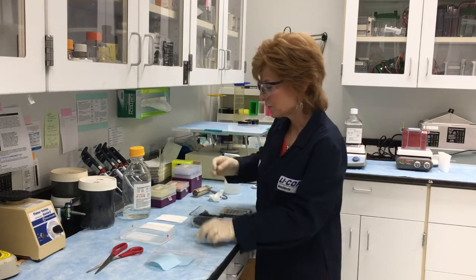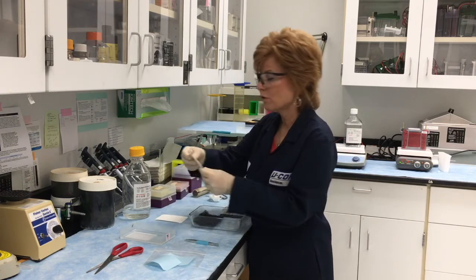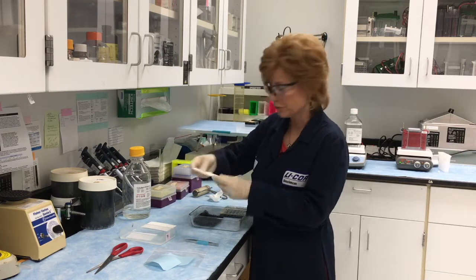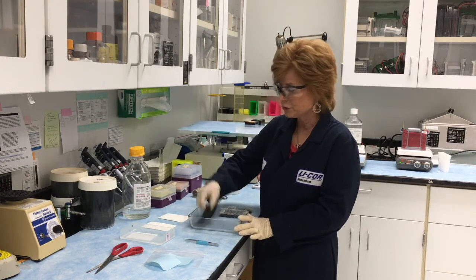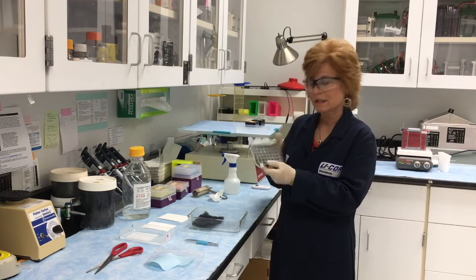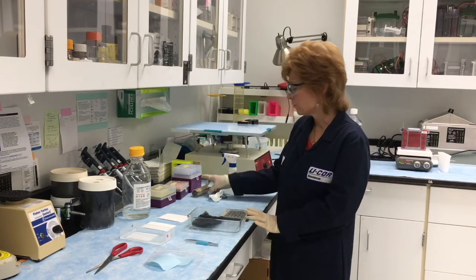I also want to make sure that I have four pieces of filter paper to make the sandwich with. I have a tray plus two sponges, the cassette to make the sandwich with, and a roller.